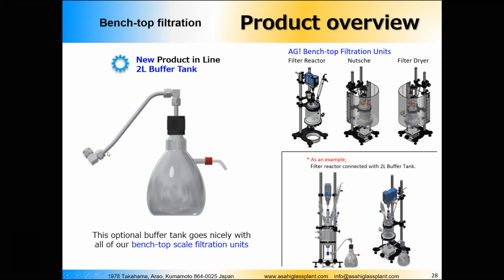Going back to my experience, I can tell you that one of the most difficult things when we're talking about the reaction systems and the filtration systems and this kind of equipment is to connect one unit to another type of equipment. For example, one of the standard mistakes when we're talking about the combination of the reactor and the thermostat is the lack of the adapters that are needed.